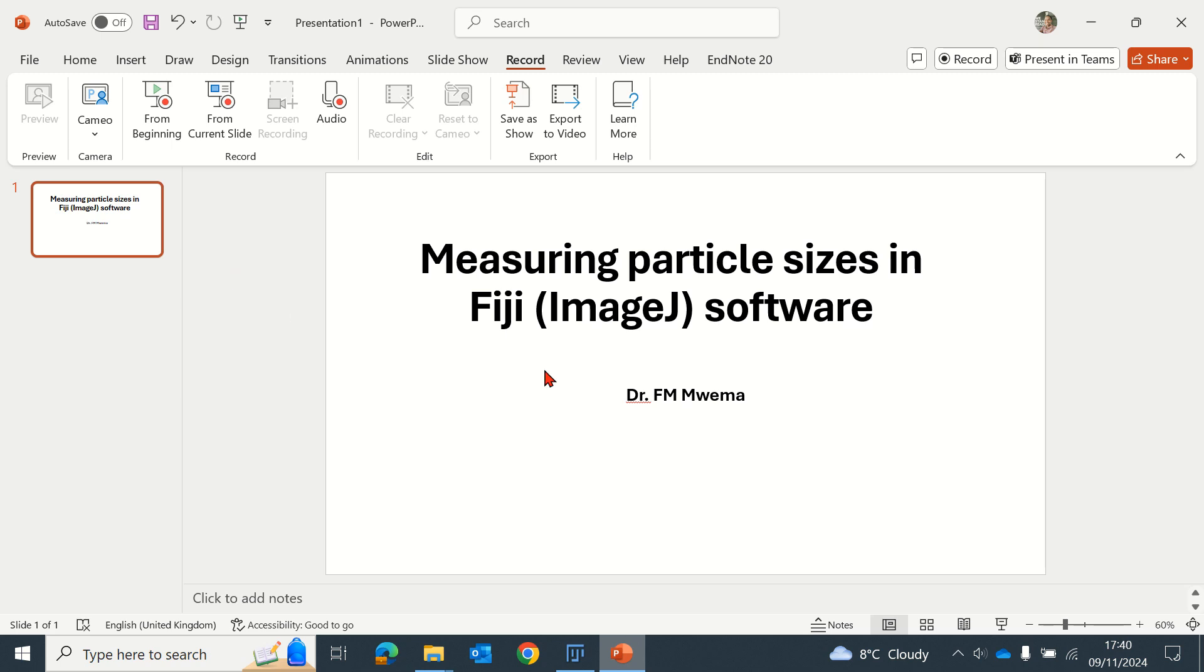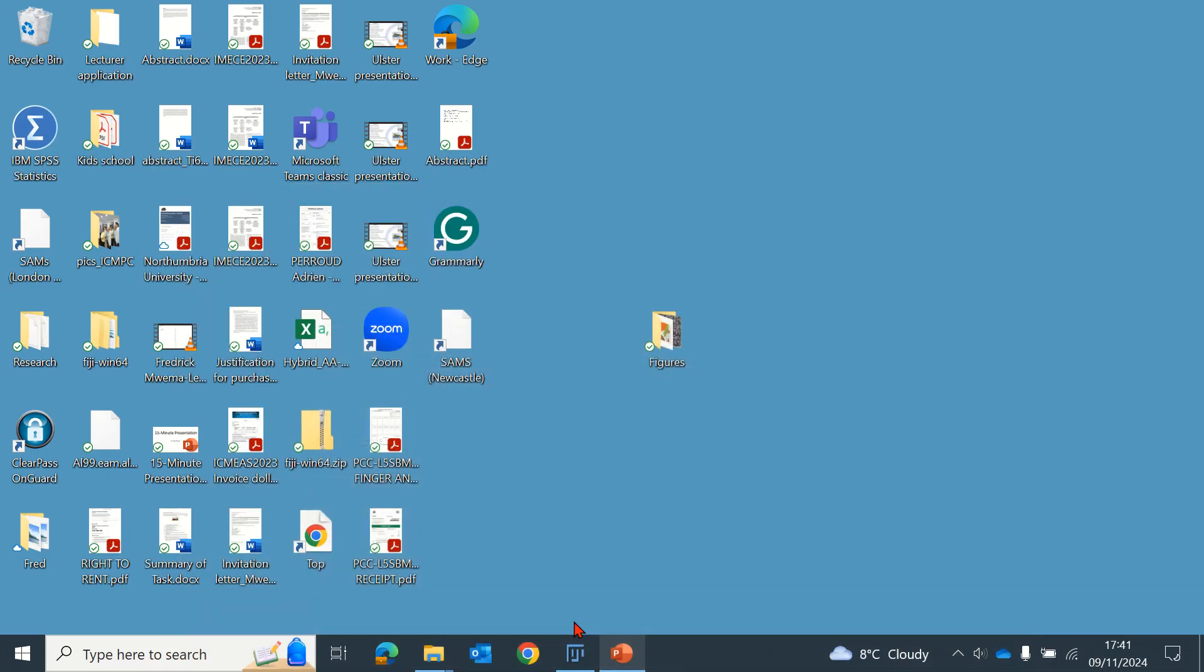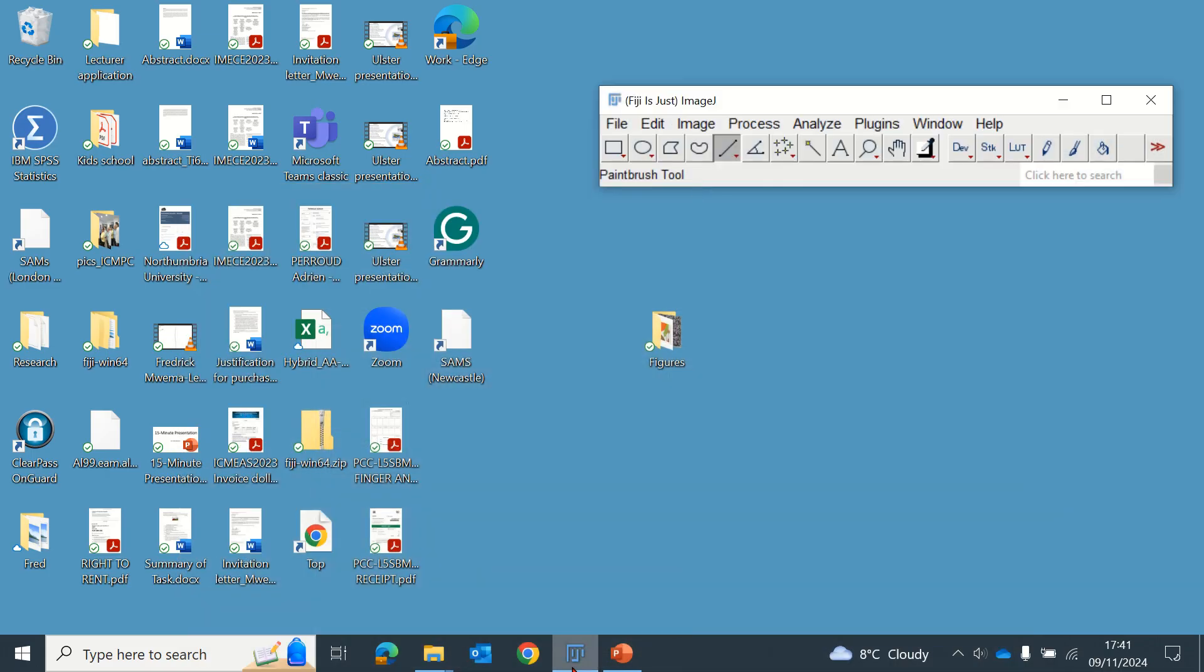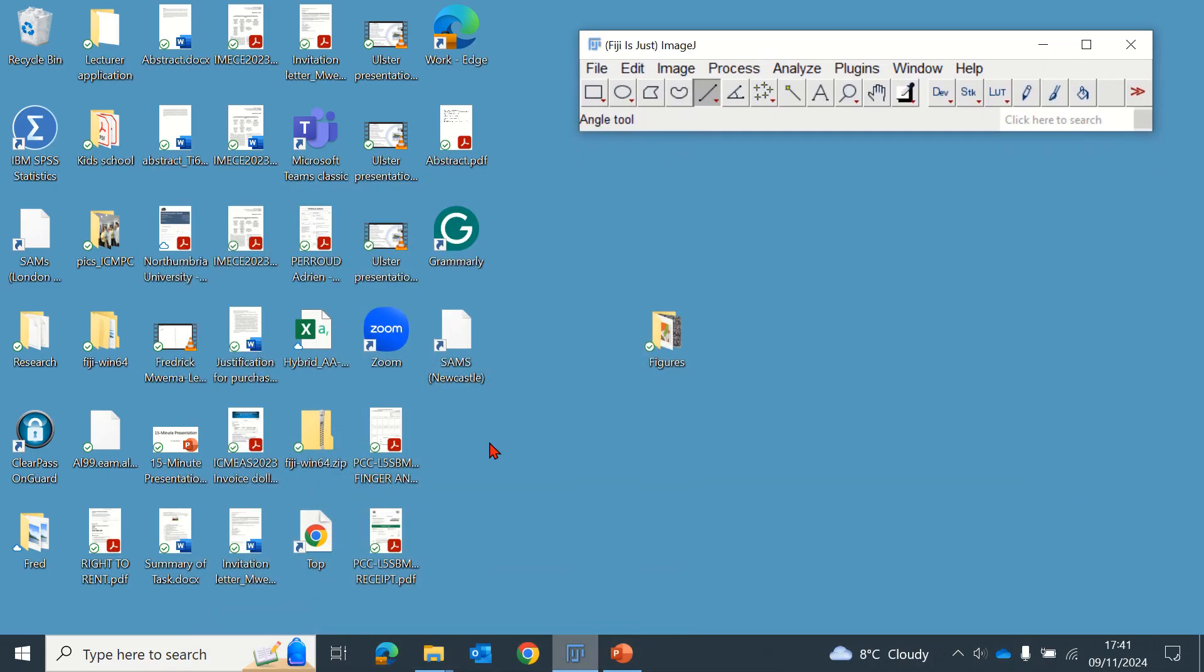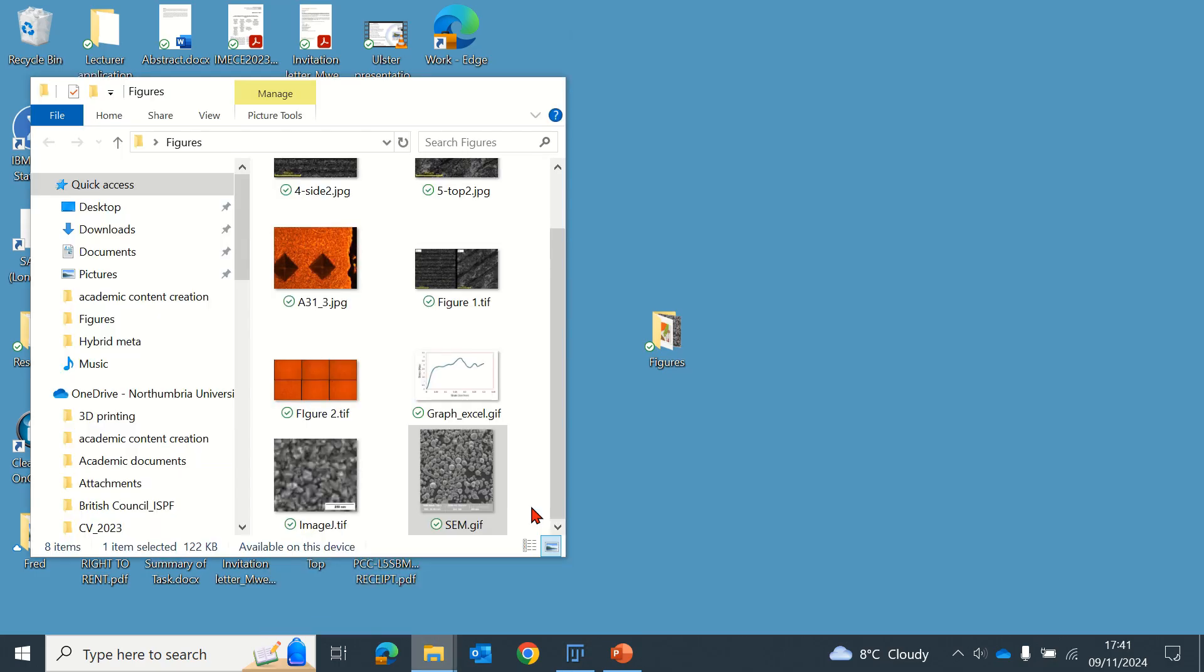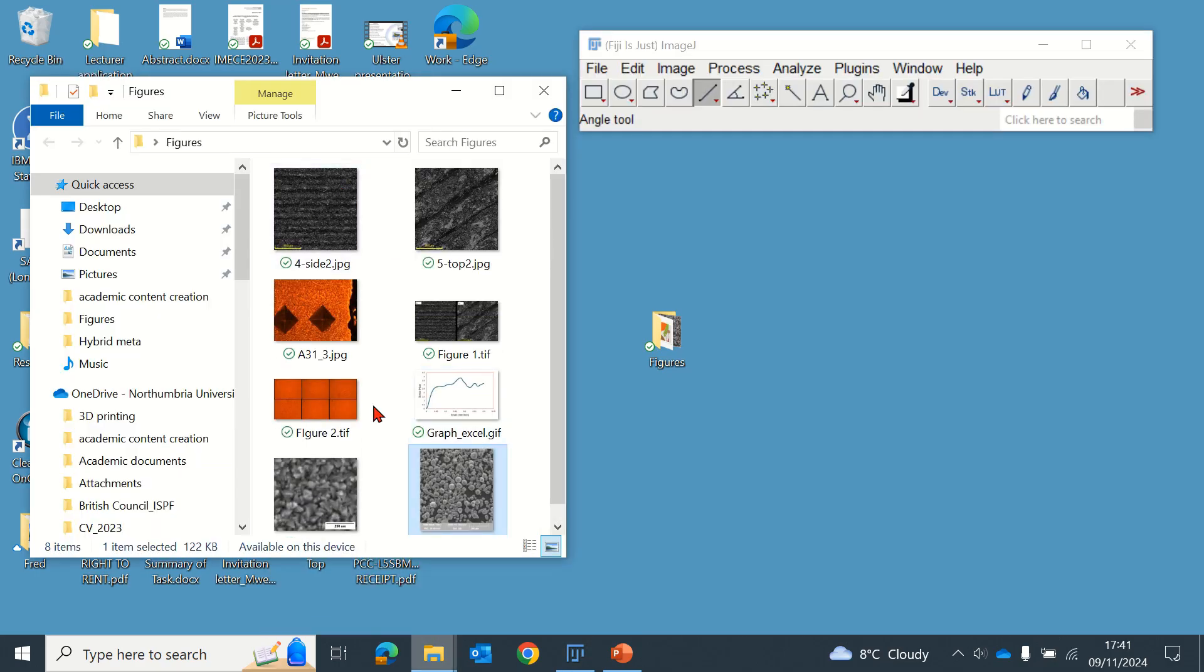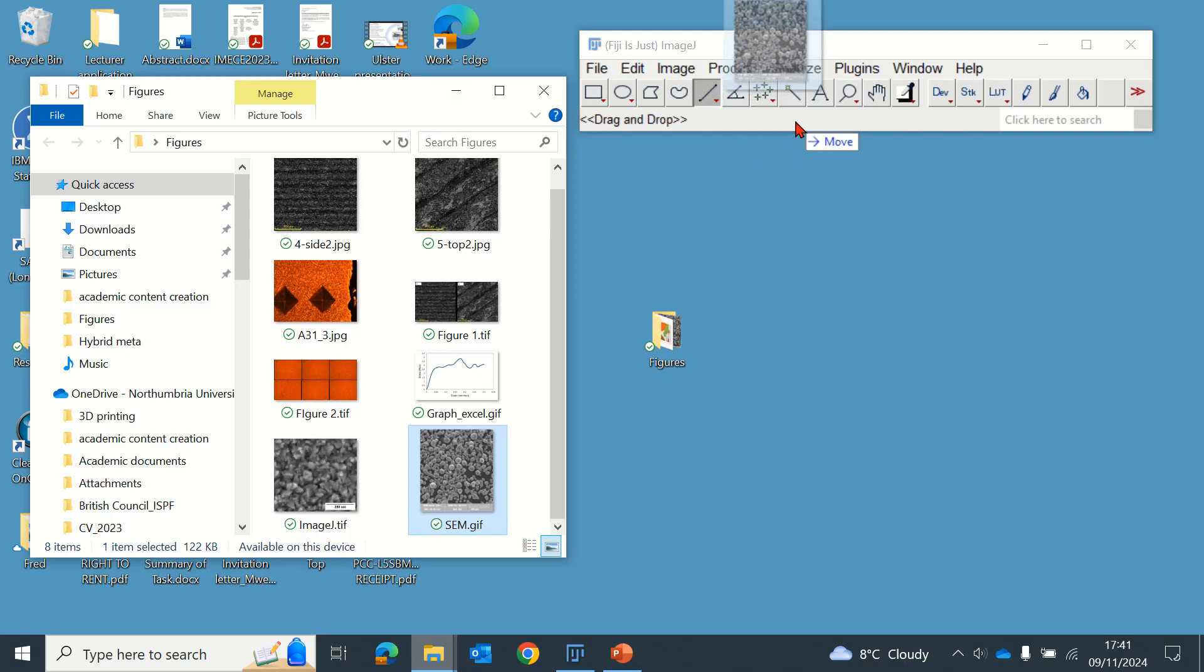Okay, hello everyone. Today I want to teach you how to measure particle sizes in an SEM image using Fiji software. You start by opening the Fiji software, then you open an image by dragging the image to the software.